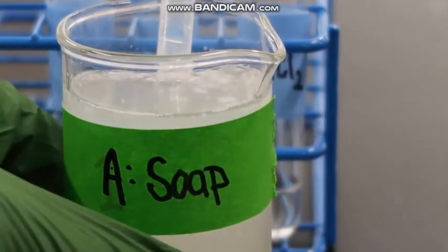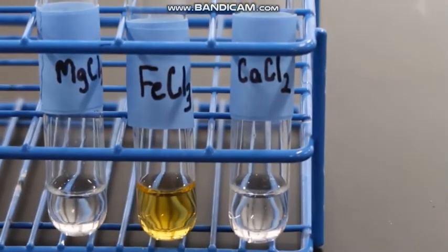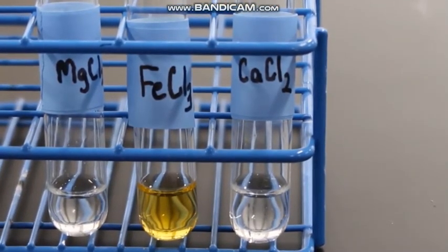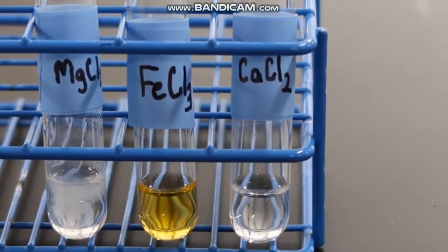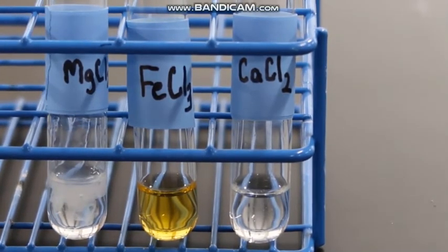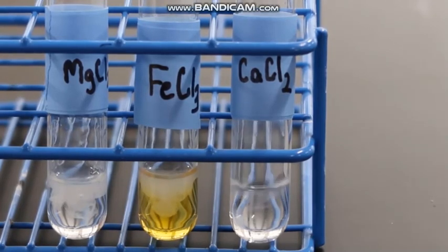Our last set of observations, we'll be looking at the effect of hard water on detergency. We'll be placing our soap solution into each of these test tubes, one containing magnesium chloride, one containing iron chloride, and one containing calcium chloride.